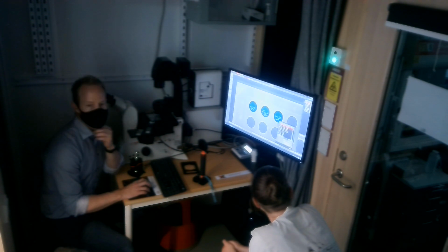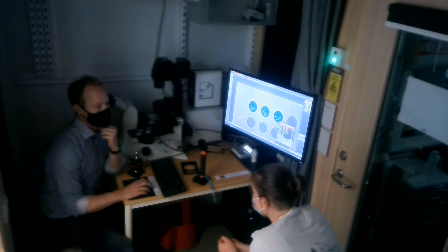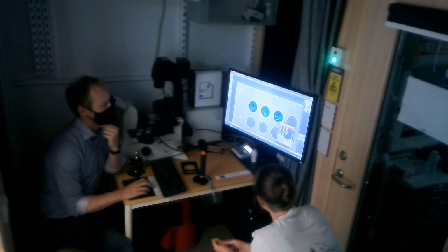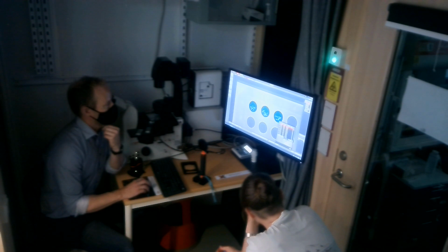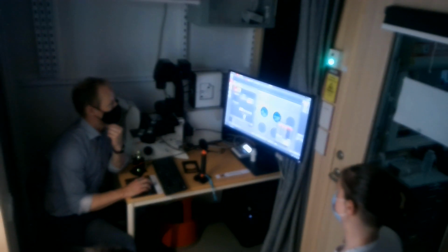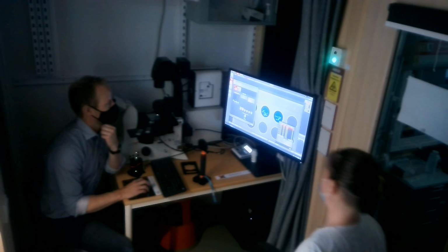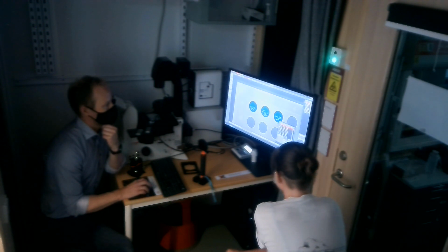And here we do not have a Z stack, right? No, we're not doing a Z stack at the moment. I don't know if that's something you typically do. No, I don't think I would. Alright, so it's all done, and now comes also the selection. If you wanted to do a bright field or not, I can take it away for now. So we're just gonna do this one. So we can just start this.